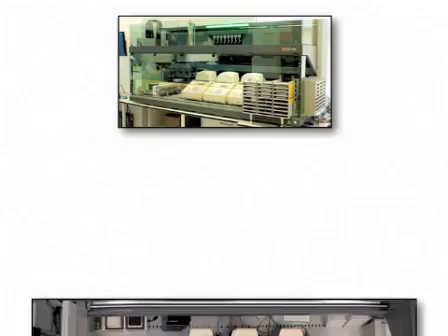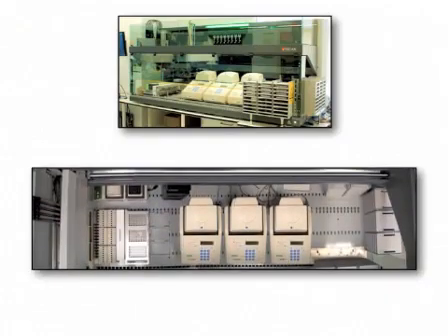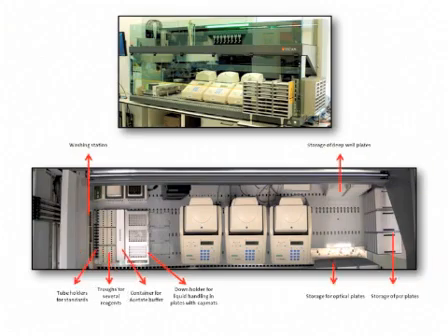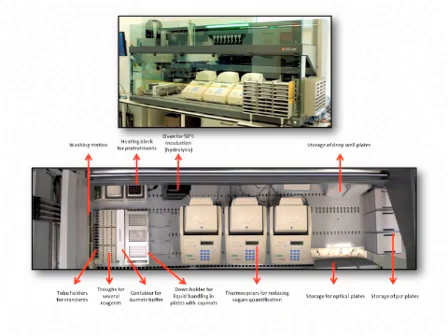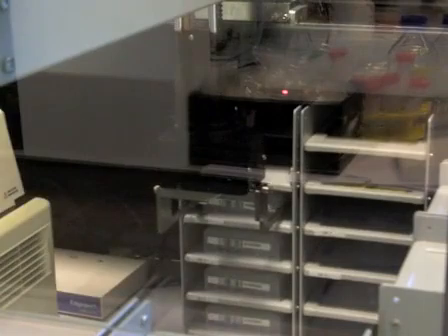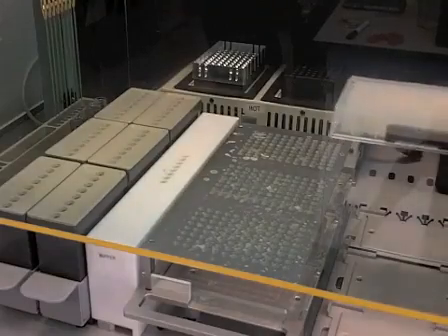In the liquid handling robot, pre-treatment, enzyme hydrolysis and determination of sugars released are done automatically. The 2-meter table has containers for the different reagents needed, as well as storage space for the plasticware. There are incubators for pre-treatment and hydrolysis, as well as thermocyclers for the sugar determination. Pre-treatment is done in the deep well plate by adding dilute acid or alkaline solutions to the biomass powder.